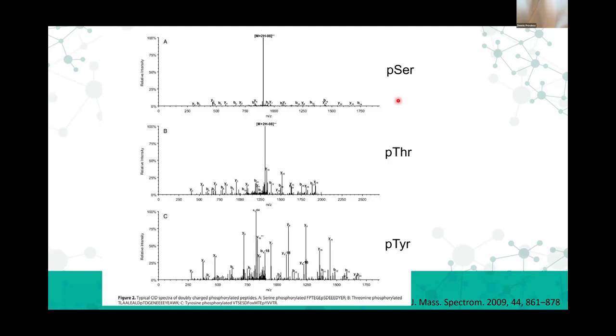So again, I said I'm like the merchant of death here, just keep giving bad news. If you look down at the bottom, if you have a phosphotyrosine, well, here's a little good news. Peptides that have phosphotyrosine actually fragment pretty well. That's because it's not energetically favorable to get a loss of 98, so it's a little harder for it to lose that phospho group, and so you get better fragmentation.